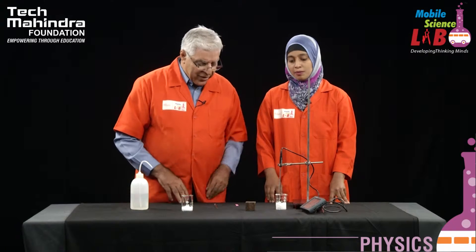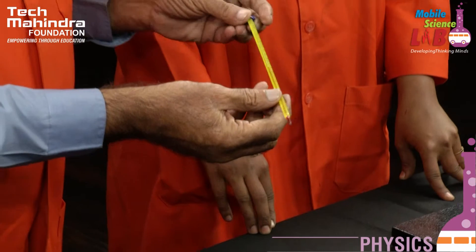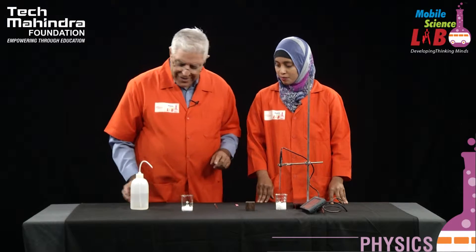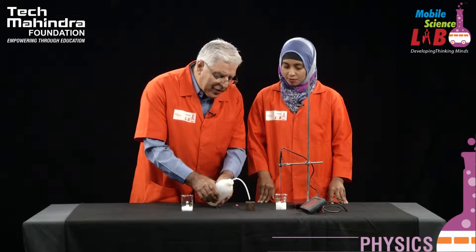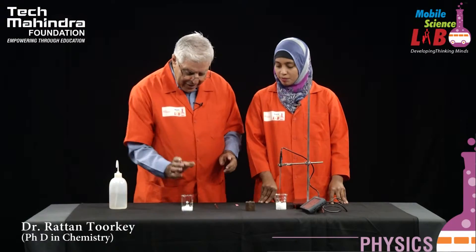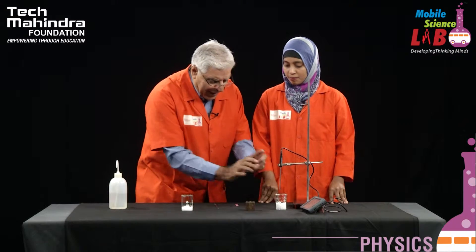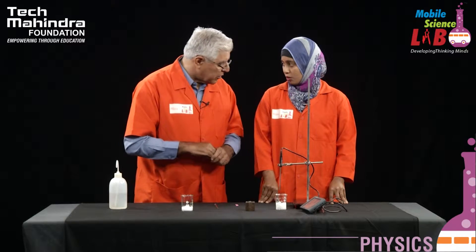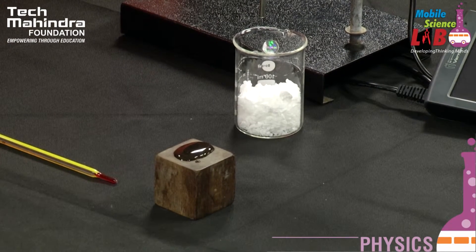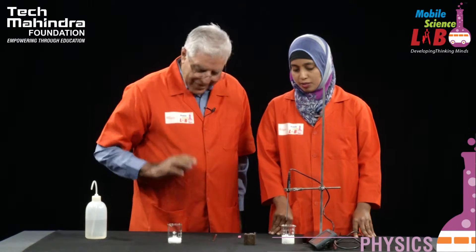Students, don't worry if you don't have this — you can always make use of a thermometer. First we'll pour a little water on top of this. Now you will take this beaker and pour it into that beaker. Place that beaker on top of this wooden block, mix it with the glass rod, and dip the thermometer probe inside so that we will be recording the temperature. Please go ahead.